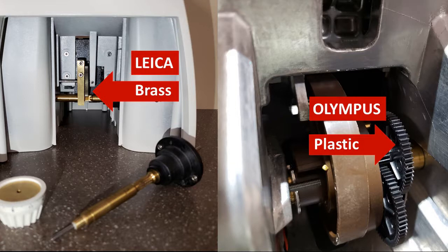Eight, all touch points of the microscope are treated with an antimicrobial paint in order to help prevent the spread of disease from student to student. Nine, the microscope is LED illuminated so no bulb changes. And ten, the microscope uses all brass gears — no plastic whatsoever.